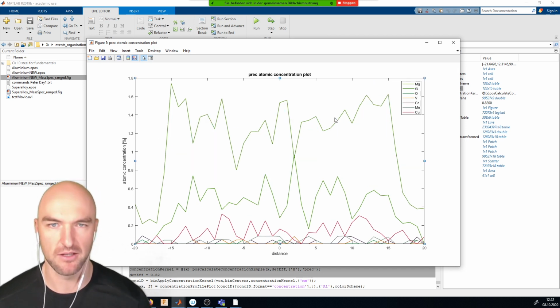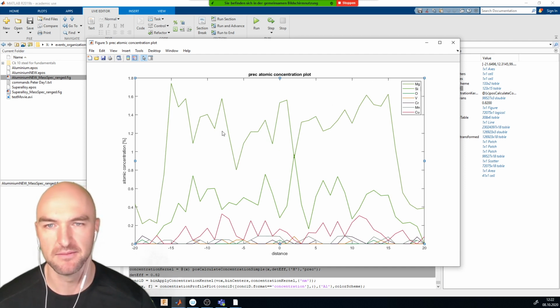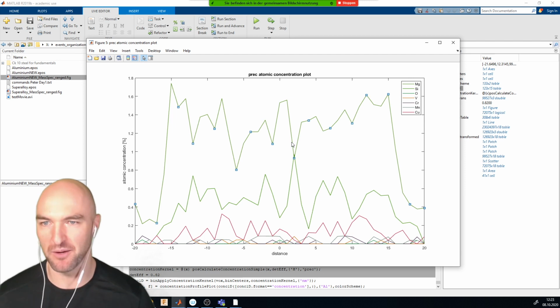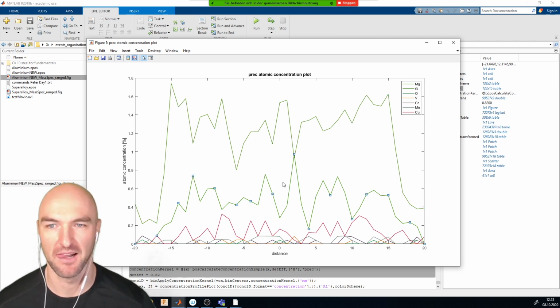Okay, so obviously the sync is not that important for us. But what you can see is that you have the silicon, mostly on... Okay, it's a bit confusing because... Shouldn't it be a stairs plot? What is a stairs plot, Andy? So this is a line plot, so you've got lines that interpolate in between the points, but actually within one bin, the calculated concentration is, we don't know where in that bin that point is.